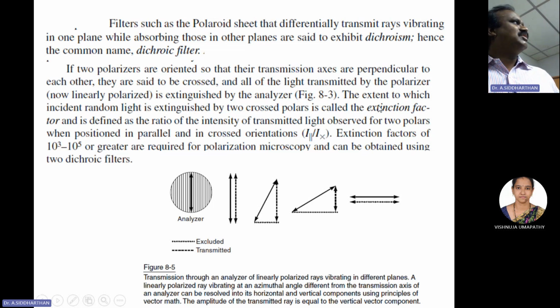Okay, one is filtered. So a polymeric chain, within a polymer, when it is formed or stretched in a certain direction, we'll find this kind of line type of arrangement. So schematically it shows, like, if there is an analyzer in this direction and we send polarized light, what will happen? 100% is going through across. If I send it like this, what will happen?